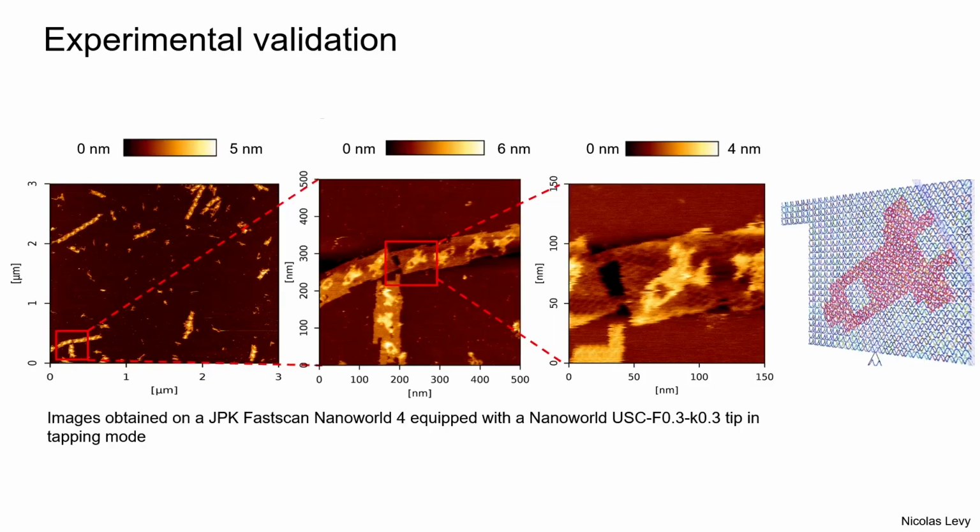The rocket design that I showed a few minutes ago was conceived entirely in EnsNano in a few hours. EnsNano is able to compute the sequences of the staples of a DNA origami with some optimization. Here are some AFM pictures that we obtained. As you can see, the origamis have the intended shape. The base and the rocket are both easily identifiable. This constitutes the first experimental success of EnsNano.